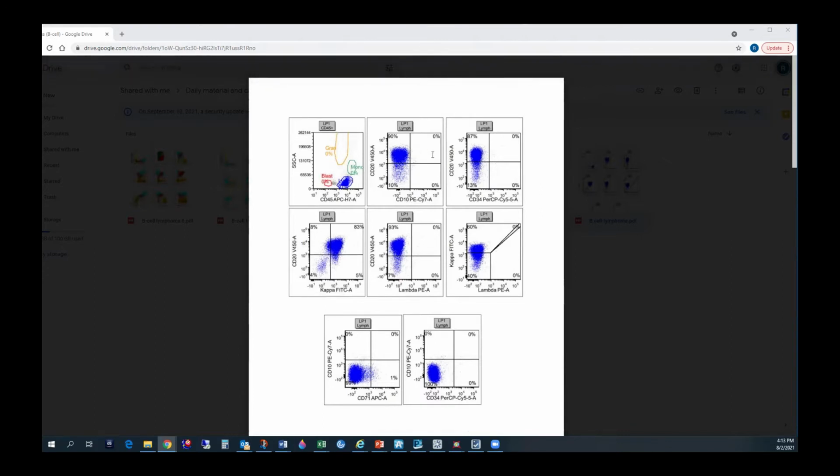Okay. Yeah. I used to go by these numbers: if it's 10 raised to power 2 to 3, it's low, 3 to 4 is moderate, and 4 and above is bright. That's how I used to do. This is okay, but I get your point now. It's touching the line and trickling down. So it's kind of dim to moderate. Okay, exactly. All right. So any other questions with this one?